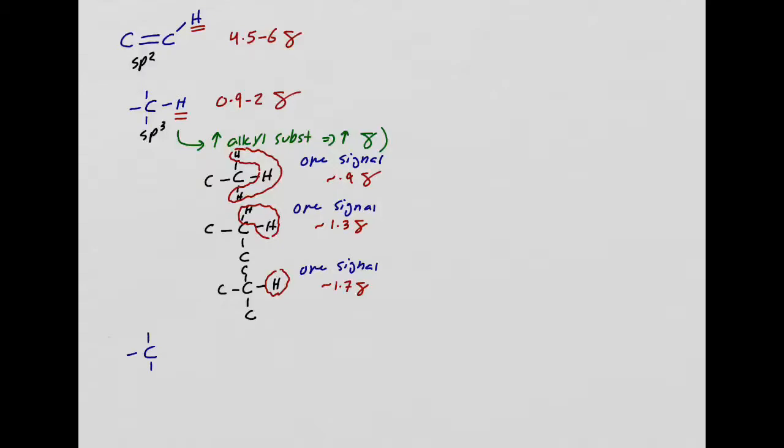We could have this again, and I'm looking at this hydrogen because in NMR we're looking at proton NMR, we're looking at hydrogen. Now, in this case, one of the substituents attached to carbon is Z, and Z is going to be an electronegative atom. It's going to be nitrogen, oxygen, or halogen. Okay. Now what's going to happen? What do you think is going to happen?